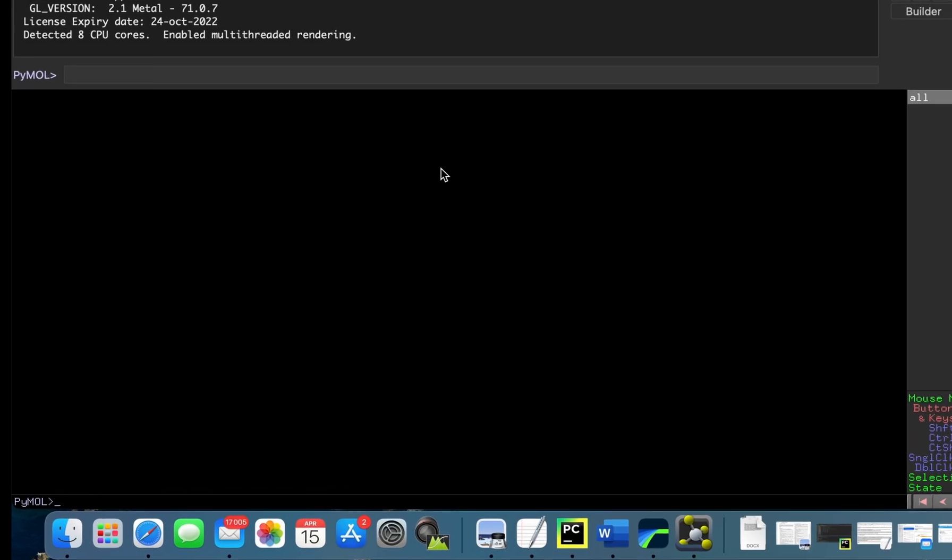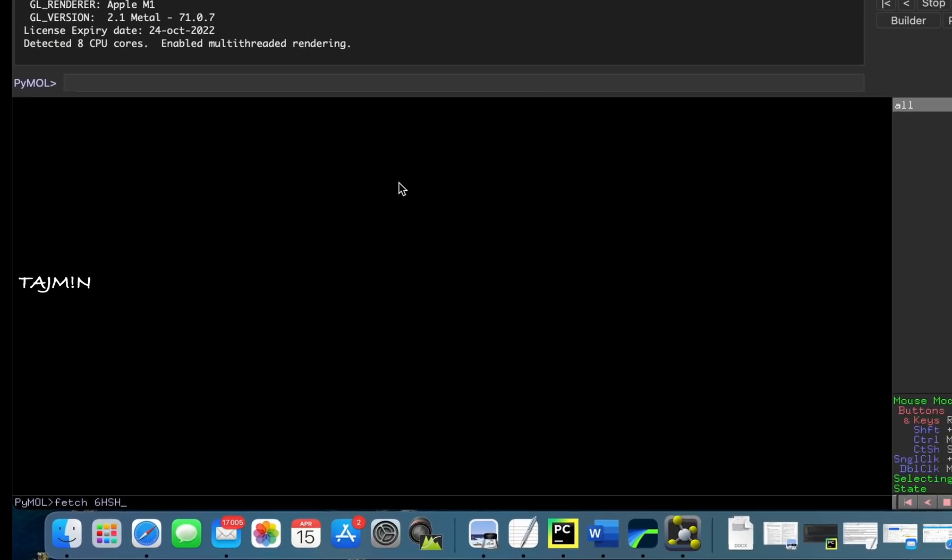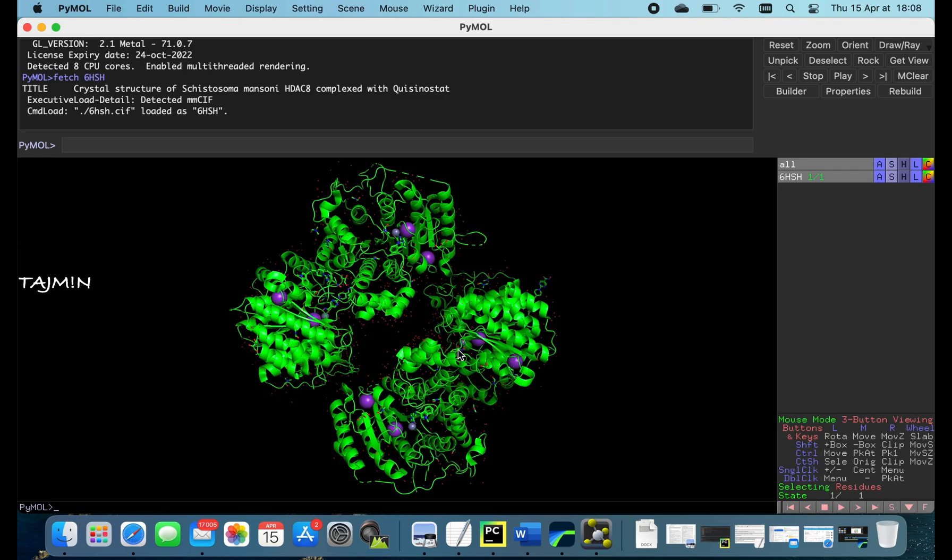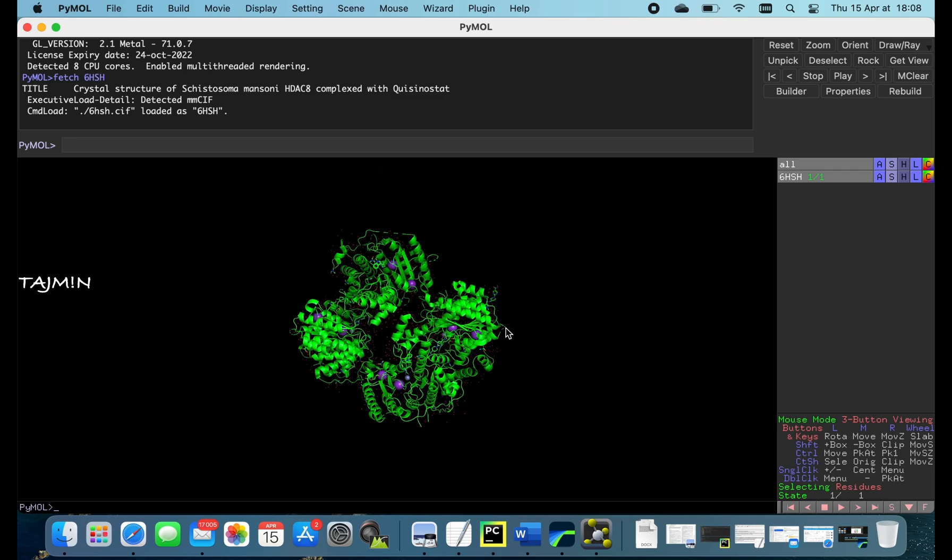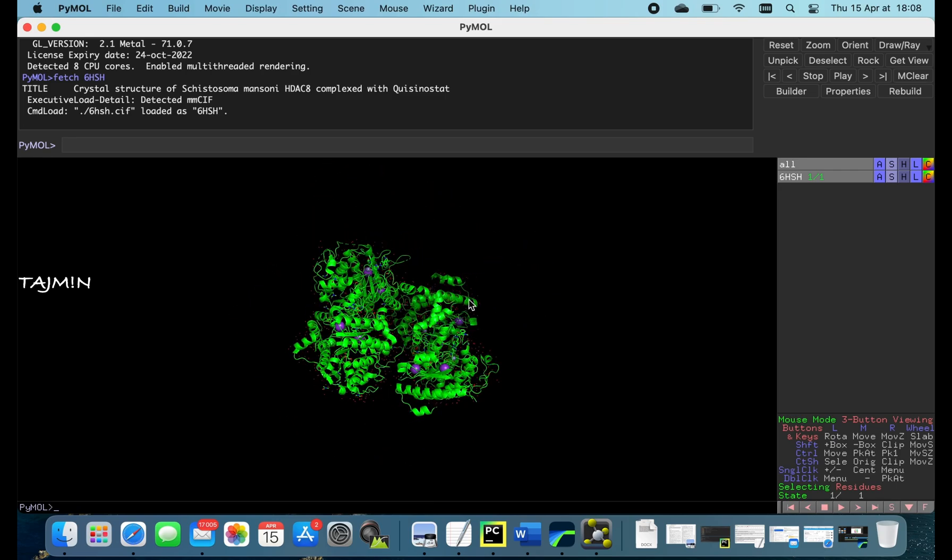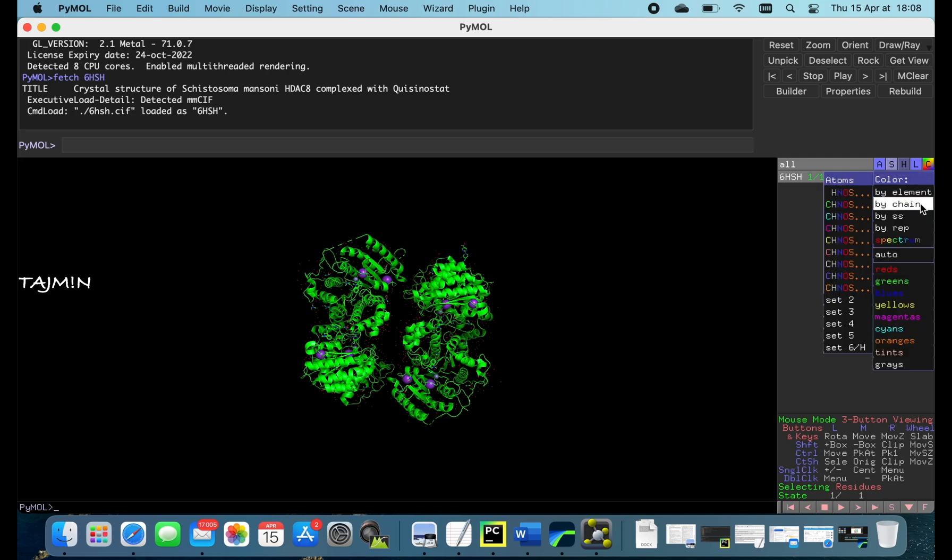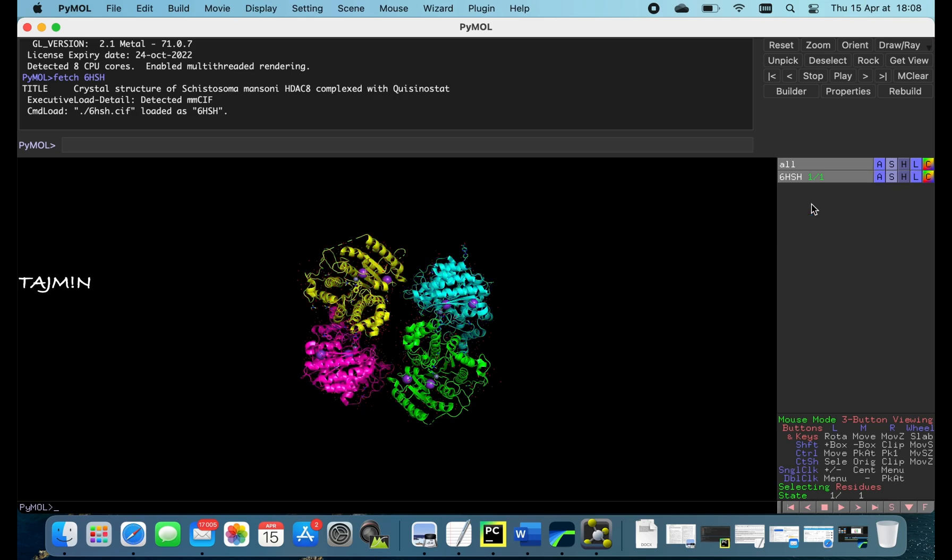First let's start with Pymol. I will open one of my structures 6HSH. This is the structure of HDAC8 with Quisinostat inhibitor which I have solved during my PhD. Let's color by chain. Four HDAC8 monomers are in the asymmetric unit.